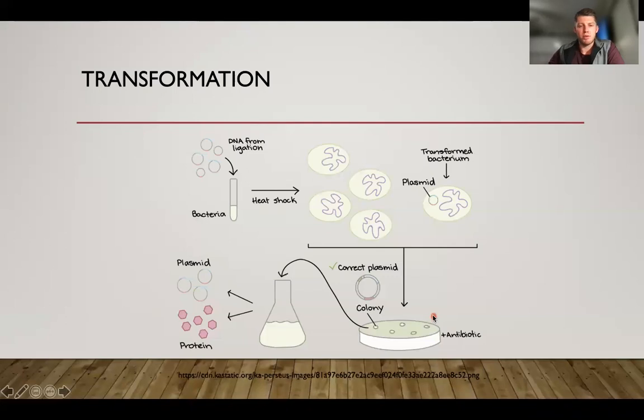purified mutated plasmid, that plasmid can be joined with some competent bacterial cells in a tube and exposed to high levels of heat for a short period of time, which will cause a stress response of the bacterial cells that will elicit them to take up the plasmid from the environment.